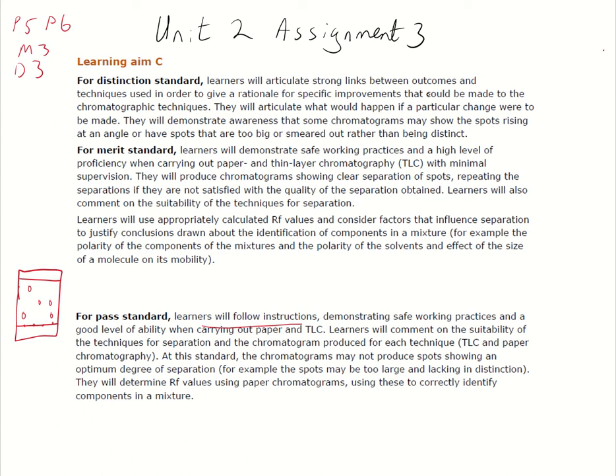Solvent line should be marked with a pencil. Likewise, you should have your initial starting point there. And then, as I said, clear dots on there. If they are too big, too smeared out, just repeat it. The other bit within it, you will determine the RF values and use these to correctly identify components.